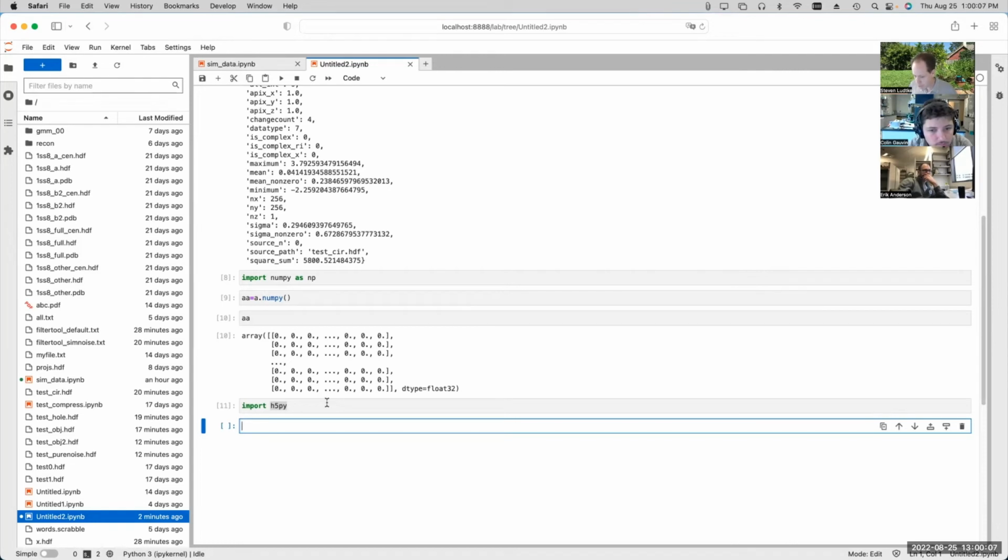So EMAN2 and IMOD and Chimera are the three CryoEM packages which all have some level of HDF5 support for the style of HDF5 files that EMAN2 uses. So you should be able to somewhat move your HDF5 files between EMAN2 and IMOD, although David Mastronarde just started adding that over the last few years, and it may not be perfectly robust yet.